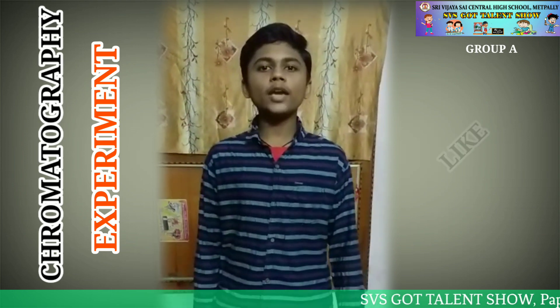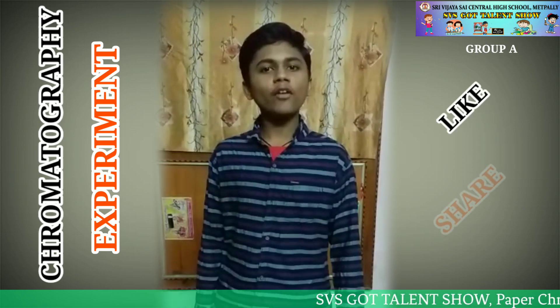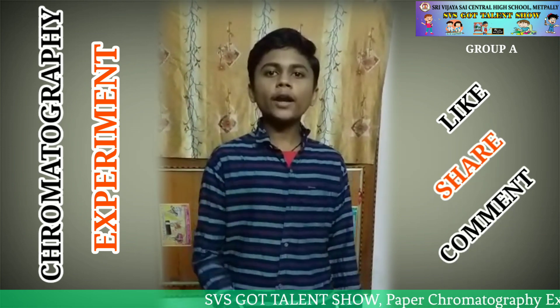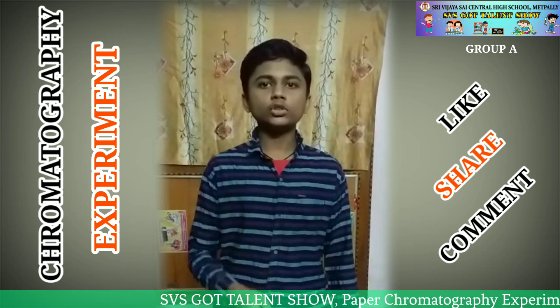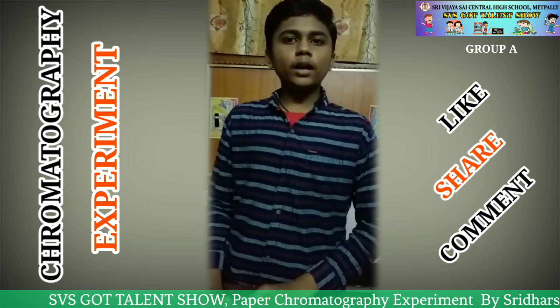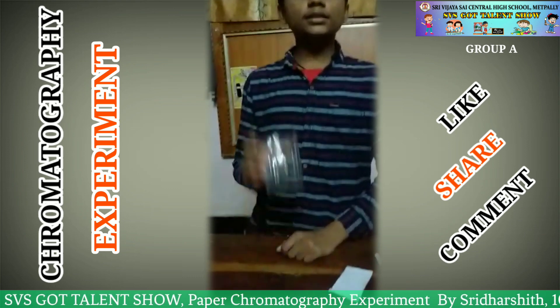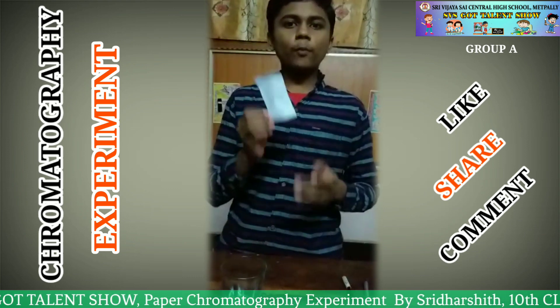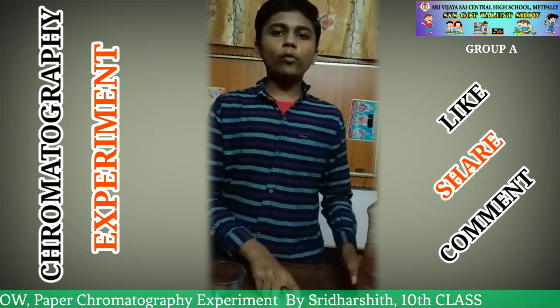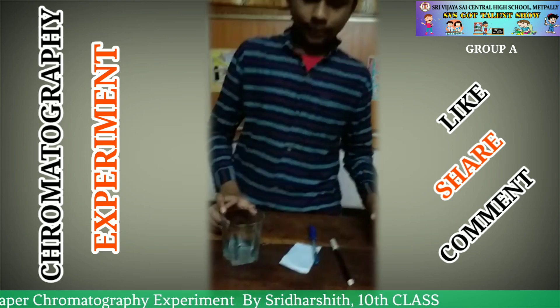Hi friends, my name is Sridhar Siddharth. I am studying at Sri Vijayasai High School. As part of the SVS GOV Talent Show, I am doing an experiment on paper chromatography. Chromatography is a laboratory technique used to separate a mixture into its compounds. For this experiment, I am taking a glass, a strip of paper, a sketch pen for holding the paper, and water. Let's start.